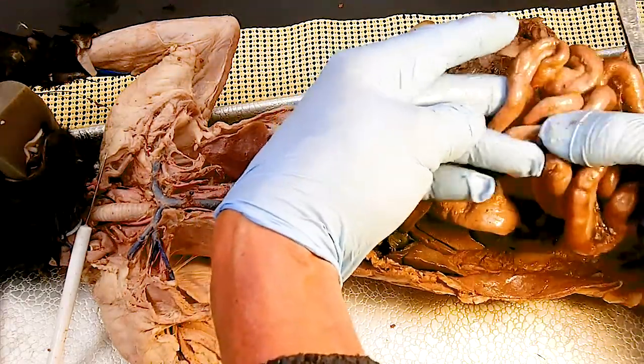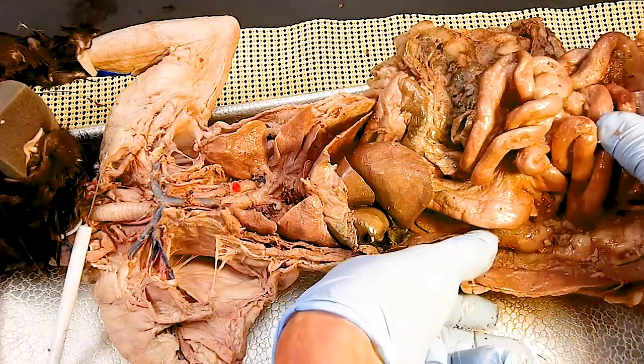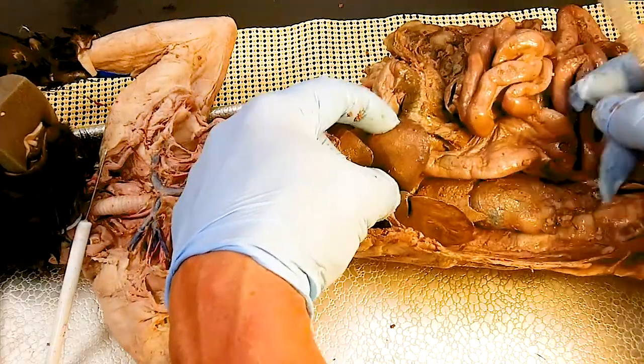Most of this, except for a bit of the duodenum, is covered by the visceral peritoneum. Lining the cavity is the parietal peritoneum, just the membrane, the serous membranes covering them. We've got the liver, we've got the pancreas.